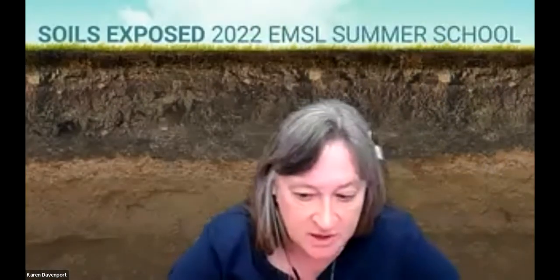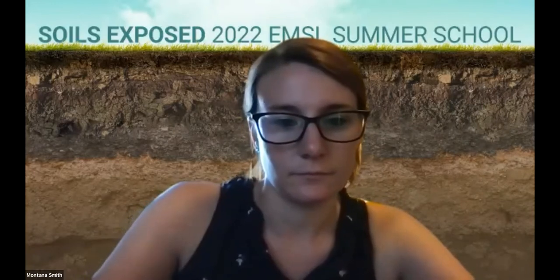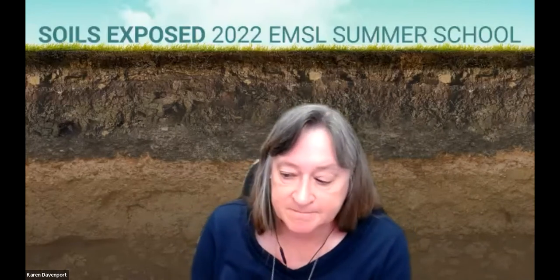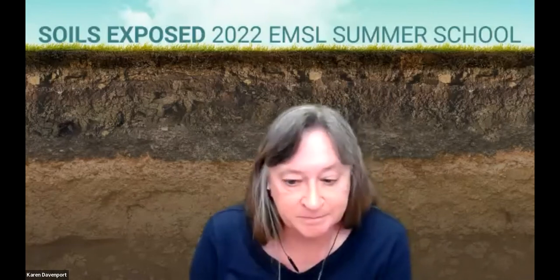We're going to explore metagenomic analysis through the NMDC workflows today. We have data from the Spruce project that we have available to you and already run through the NMDC workflows. And we'll be discussing some of the important aspects of metagenomic analysis, and hope that helps both novices and maybe some more experienced people as well.